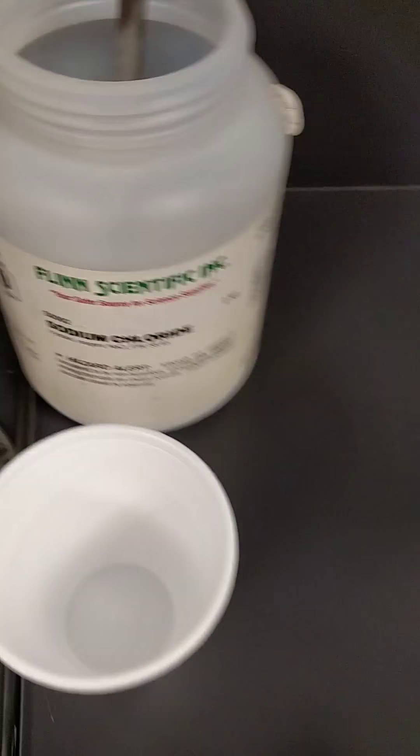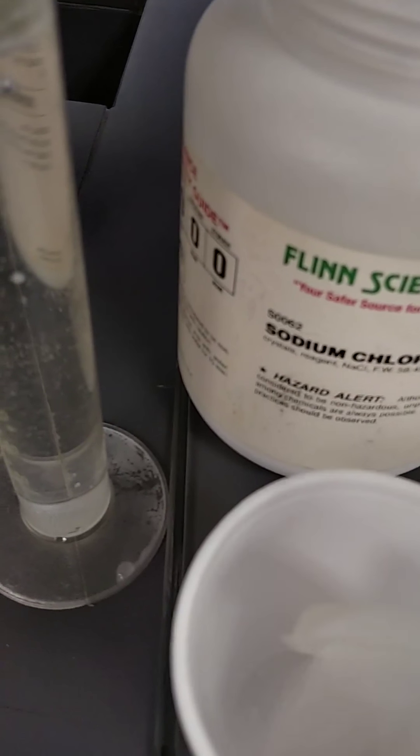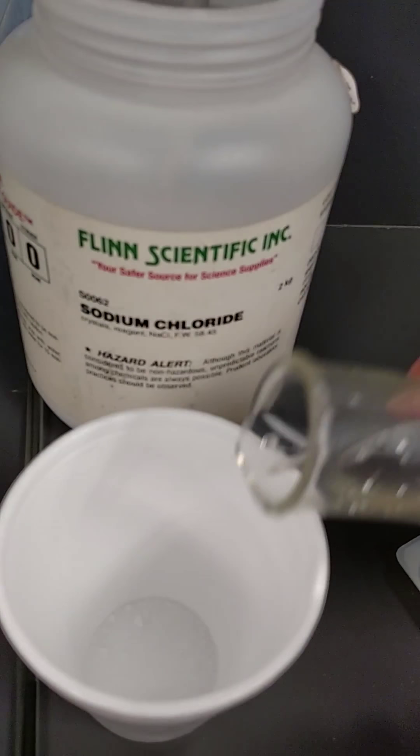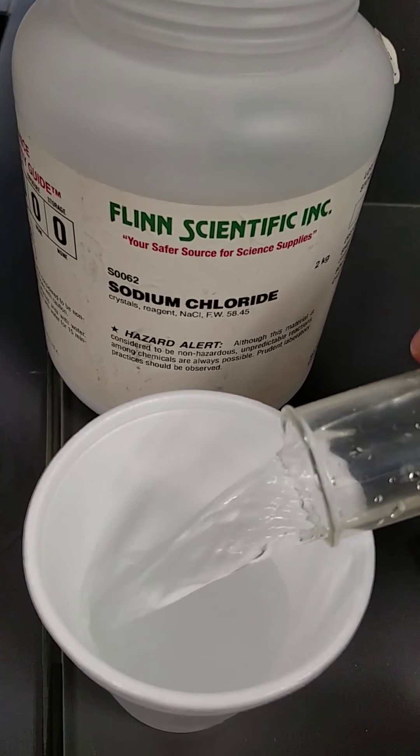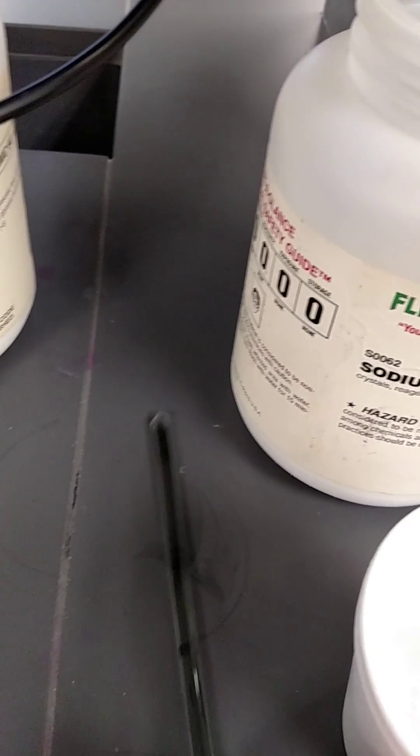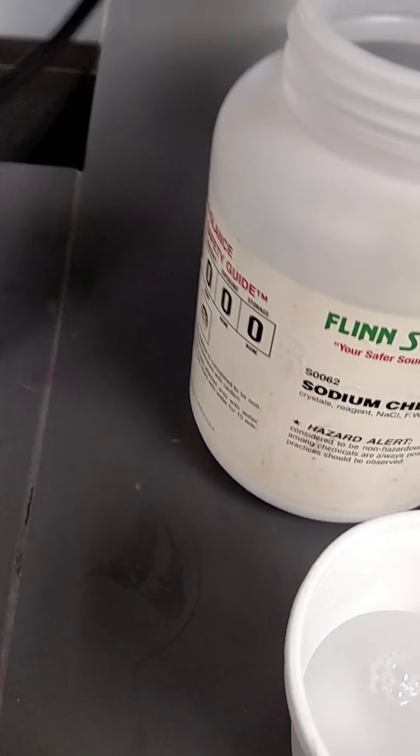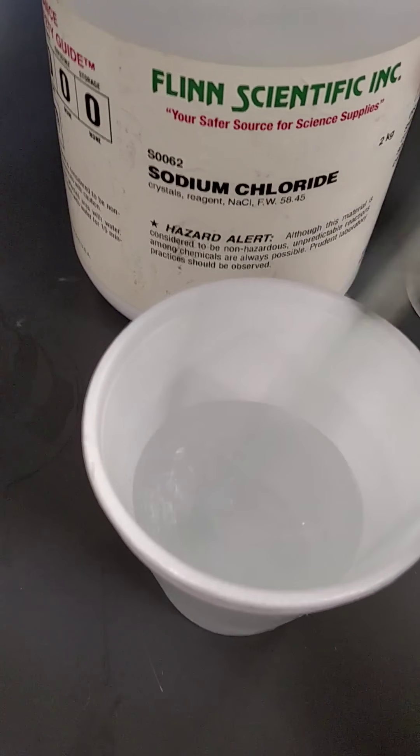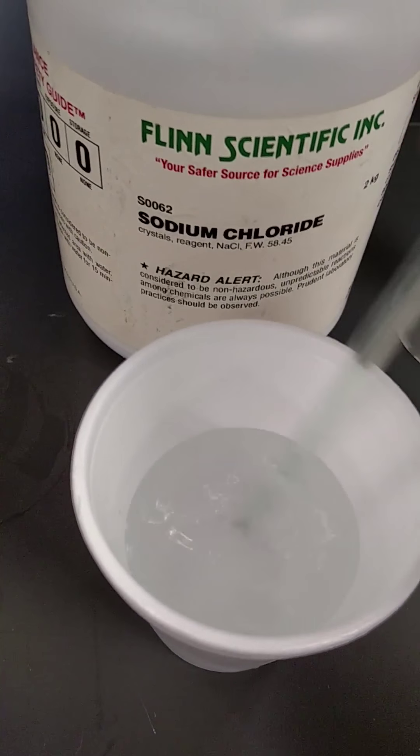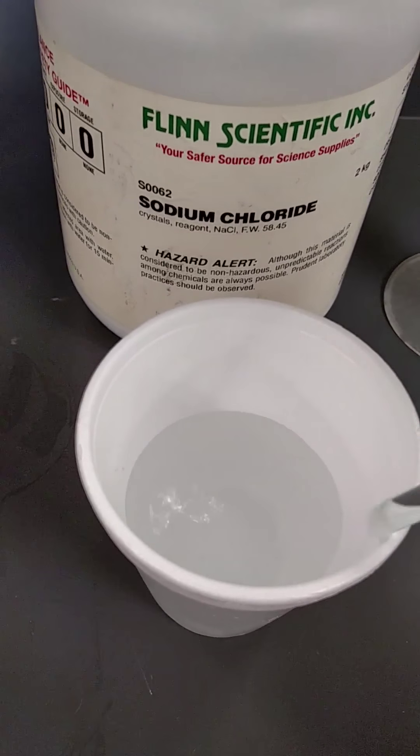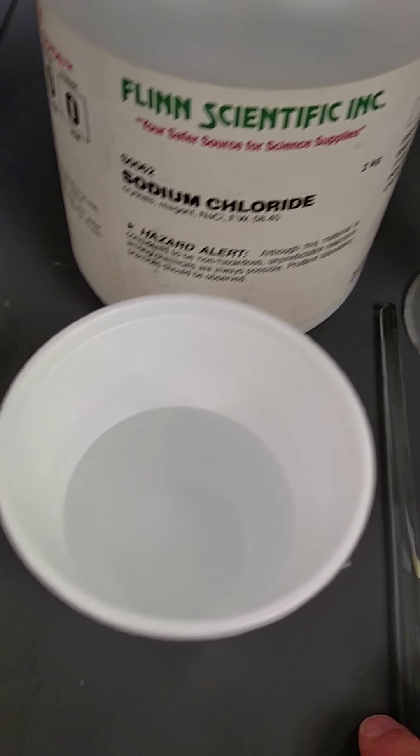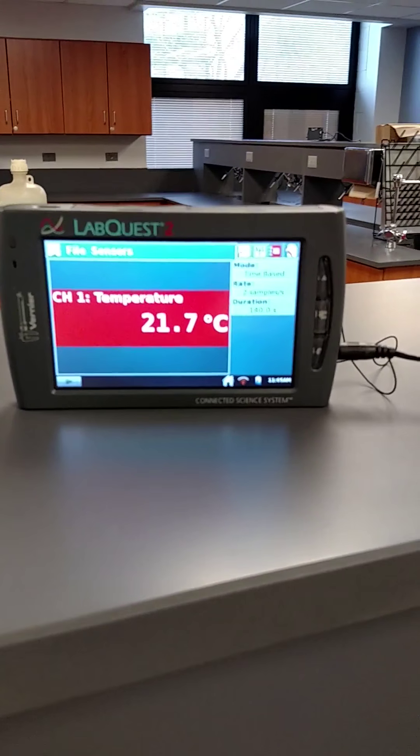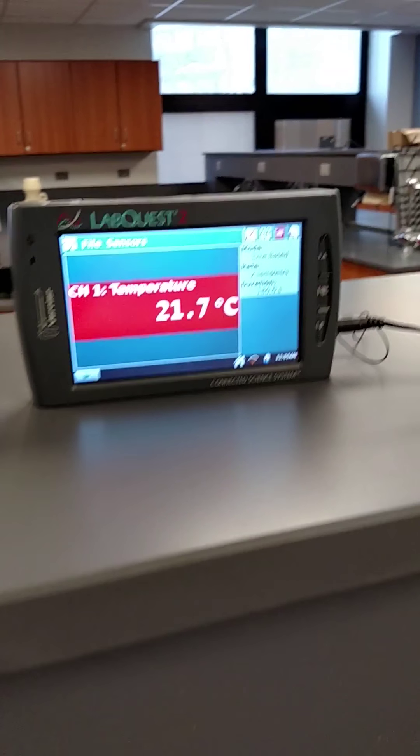Last one. Sodium chloride, 5 grams, 100 mils. Give it a stir. Initial read, 21.7.